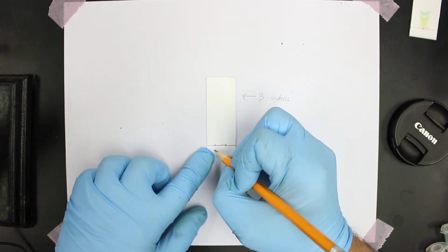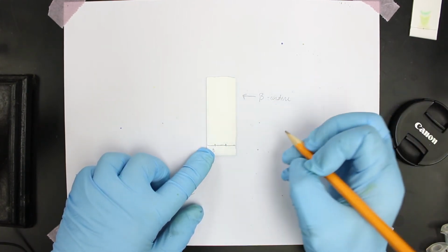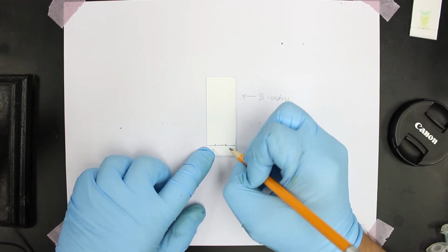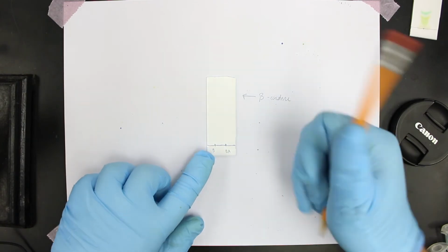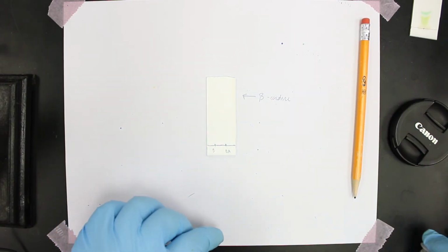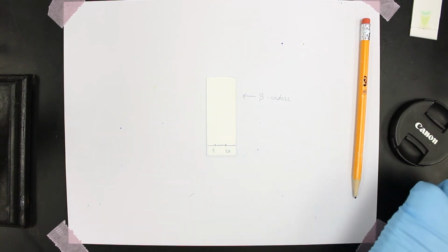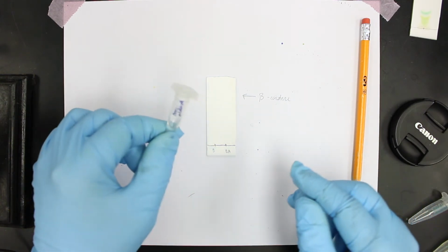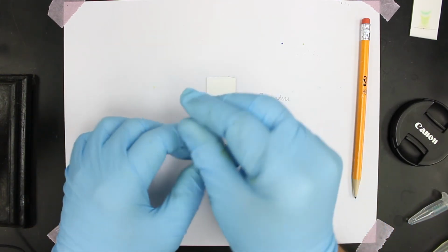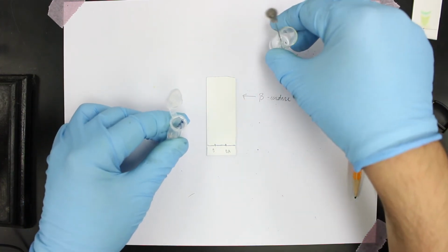In one of them, we're going to do benzaldehyde, so we'll see B is for benzaldehyde, and then on the rightmost spot, we'll do benzoic acid. So conveniently, I have some samples made up of those. So where's our benzaldehyde? Yep, here we go. So our benzaldehyde sample is here. So we can take our spotter as before and spot the plate.